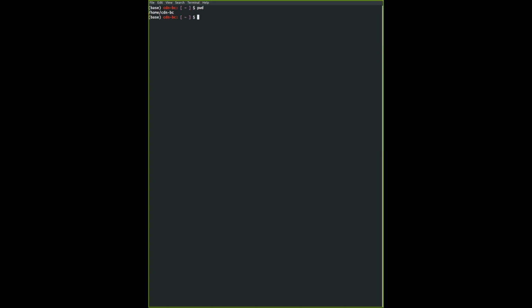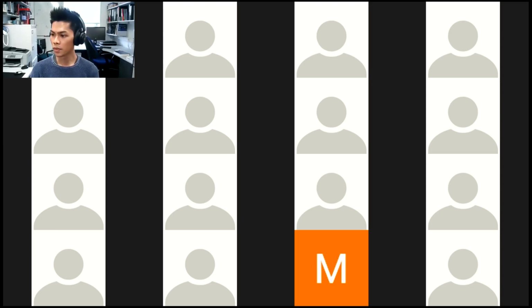Okay, I'm going to share with you a link to several images. I'll just paste this on Etherpad so you can have a look. I'm also probably going to show it on my screen as well. Let me share this quickly. So the link basically gives an idea of how the file system looks on both the Mac and the Windows.